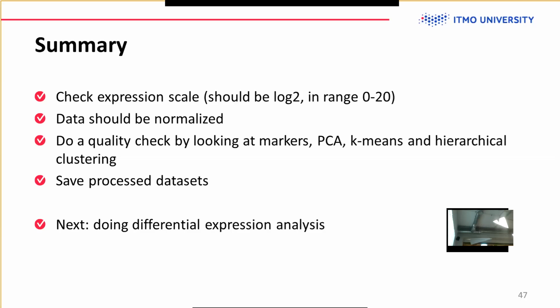It's not the proper statistic. You have just 4 samples, or 3 samples and 1 outlier. There are approaches in statistical theory, a big field, however applied to biological data, you can't really do much about it.